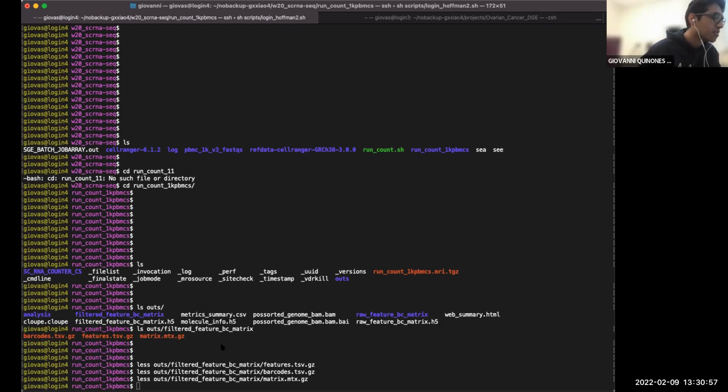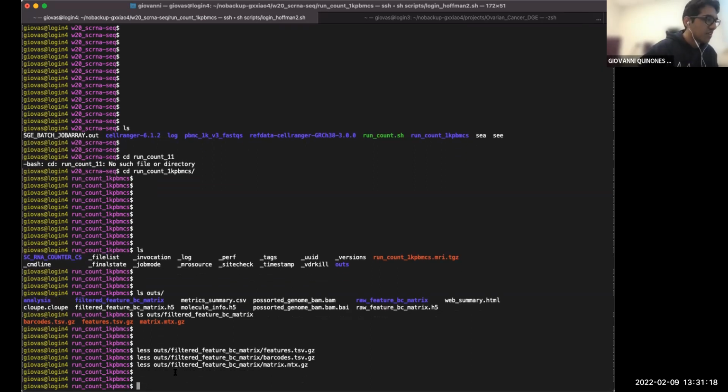I wanted to continue where we left off yesterday. It was the part where I was showing you some of the raw data that we get from, in this case, the 10x protocol. And I believe I showed you some of the FASTQ files and what they look like, and the reads and so on.